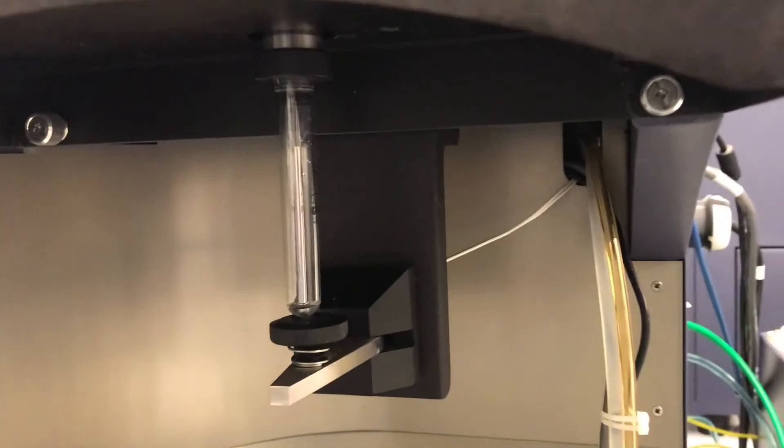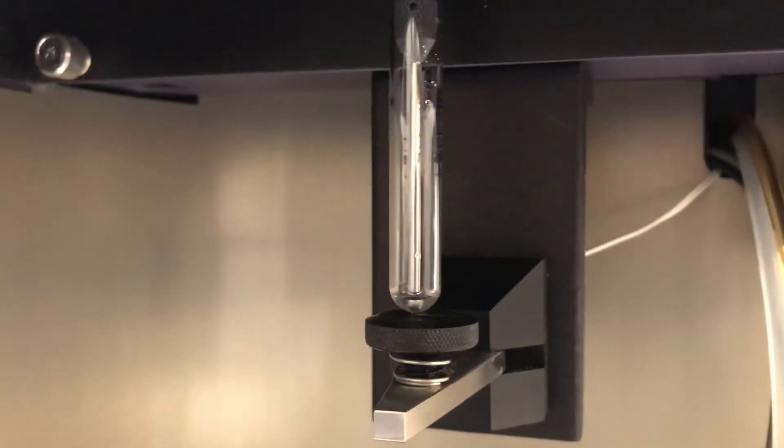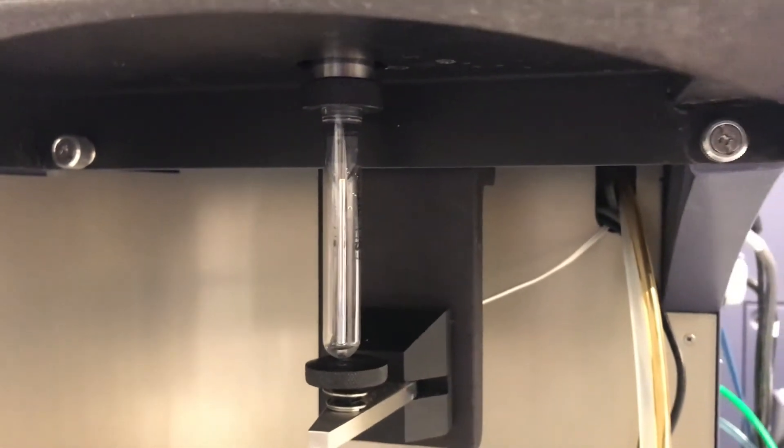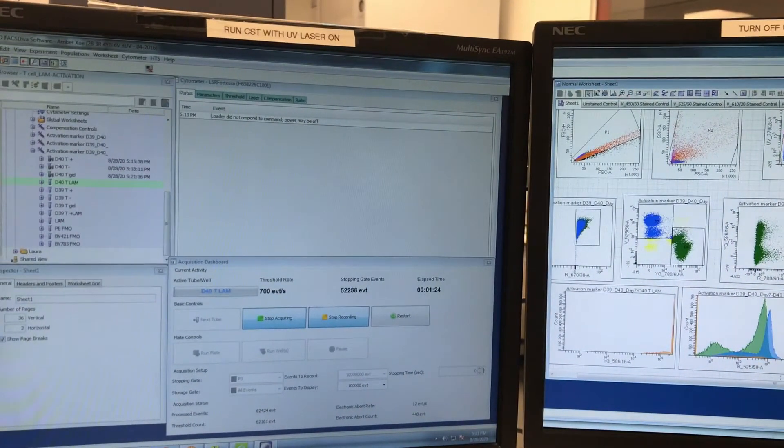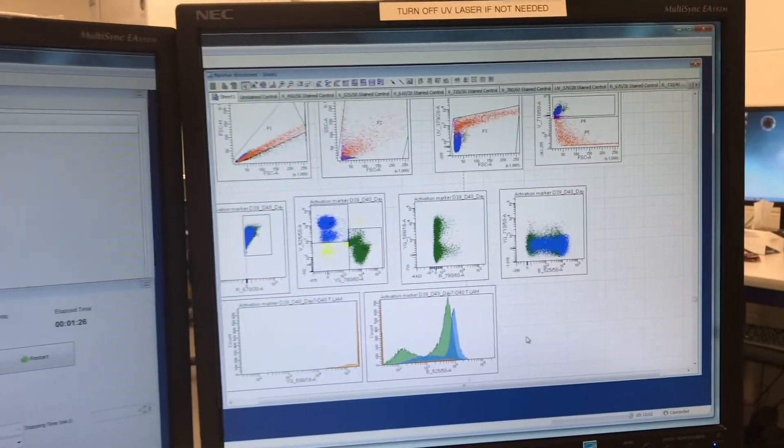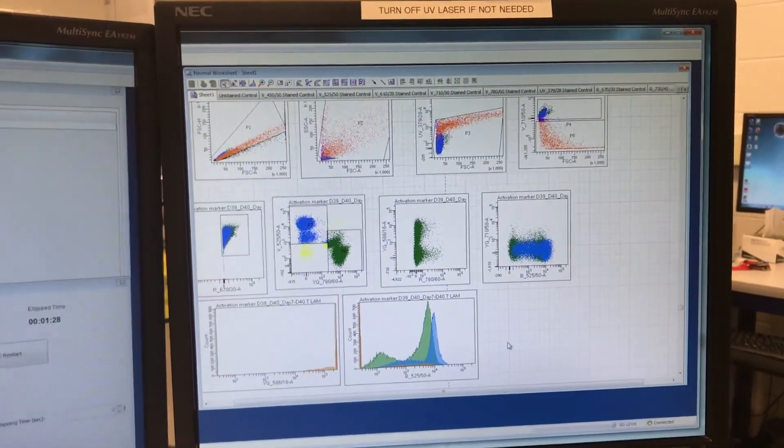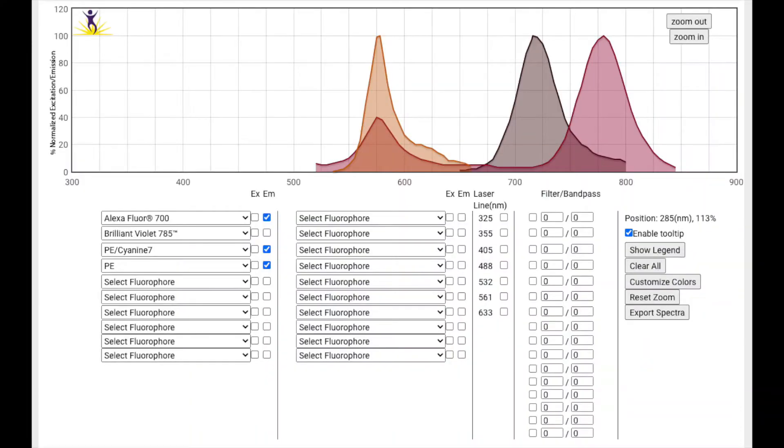Here is showing the location of where you load your samples. And your samples will be processed by the machine and interrogated by different lasers as we talked about before. If this analyzer is being connected to a computer, you can see your cells being processed and shown in different channels as you are acquiring the cells at the same time.